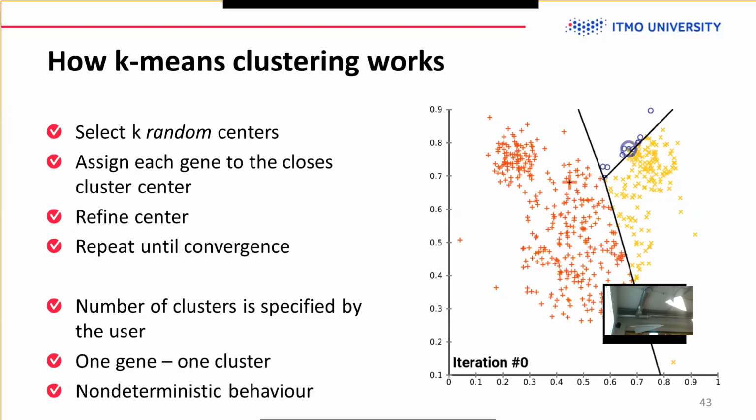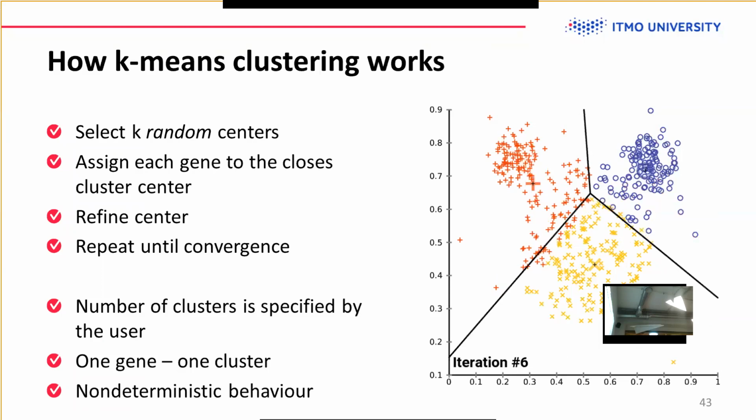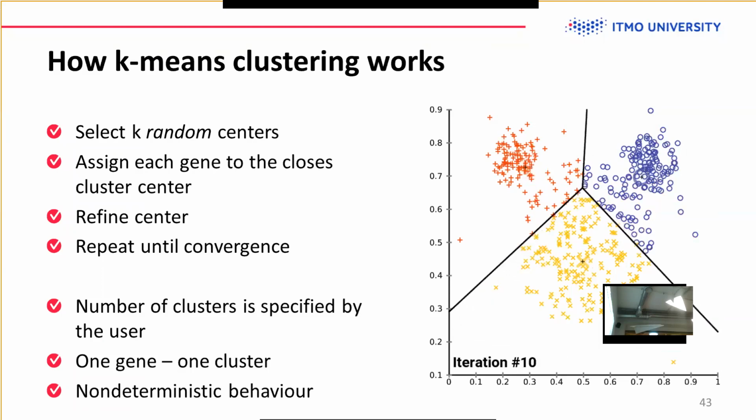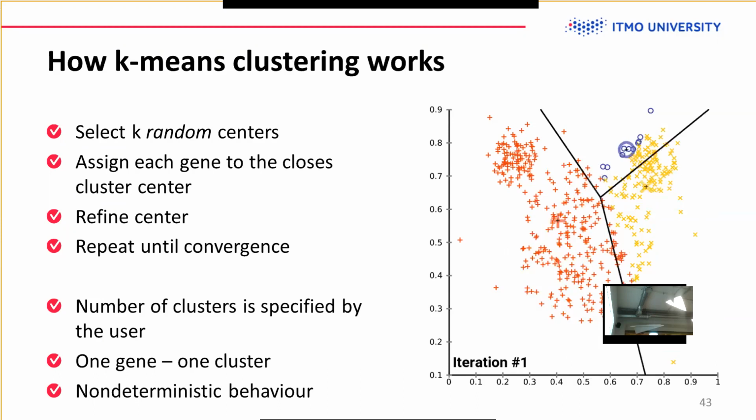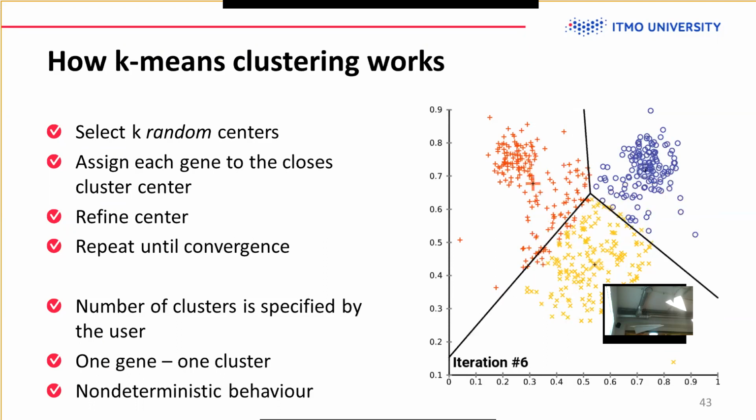But usually it depends on what you're looking for. If you just want to look at overall how the data set looks, you can do one thing, and if you want interpretation, for example, to describe these clusters, this is another one. And there is this particular clustering.